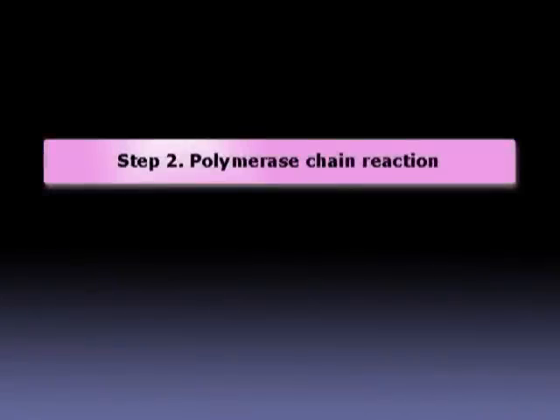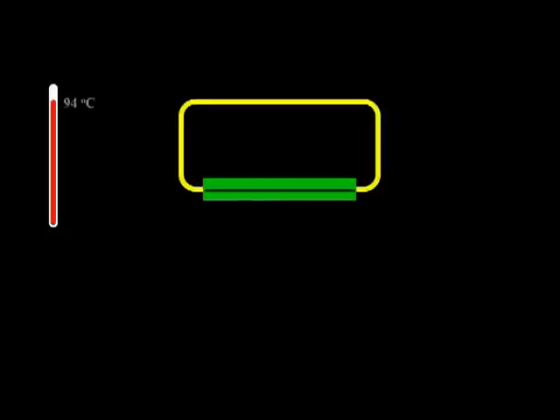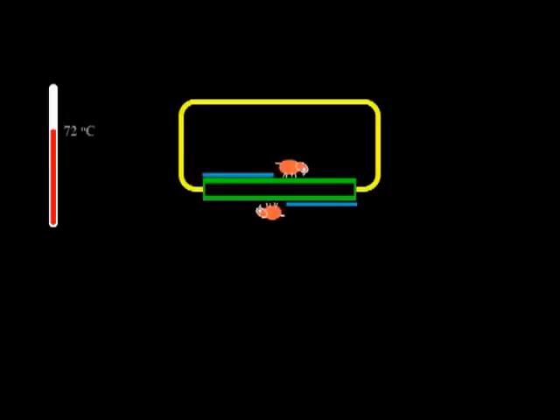Step 2, polymerase chain reaction. The protocols for setting up a PCR and programming a thermal cycler are shown here on the screen and in the protocols poster. Using polymerase chain reaction, we are going to amplify a selected region of DNA, in our case the bar gene, from our DNA template, using a pair of primers that we designed in the previous step.